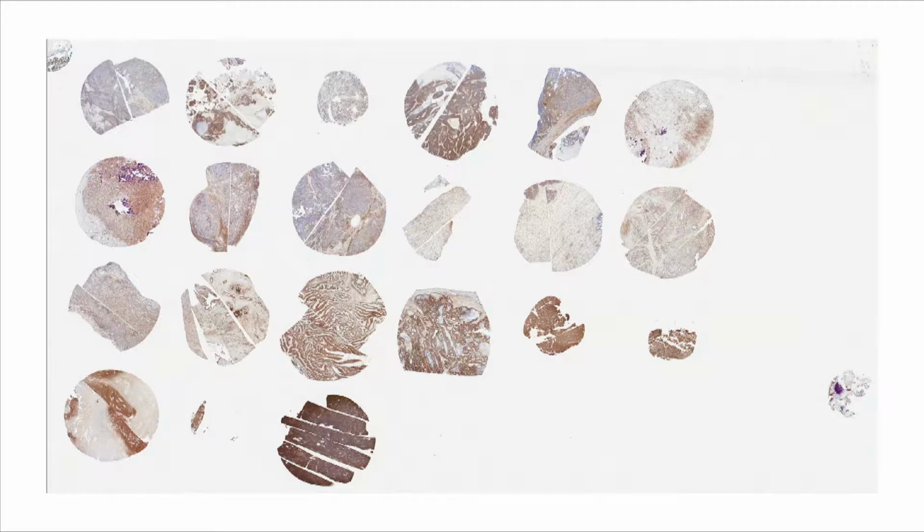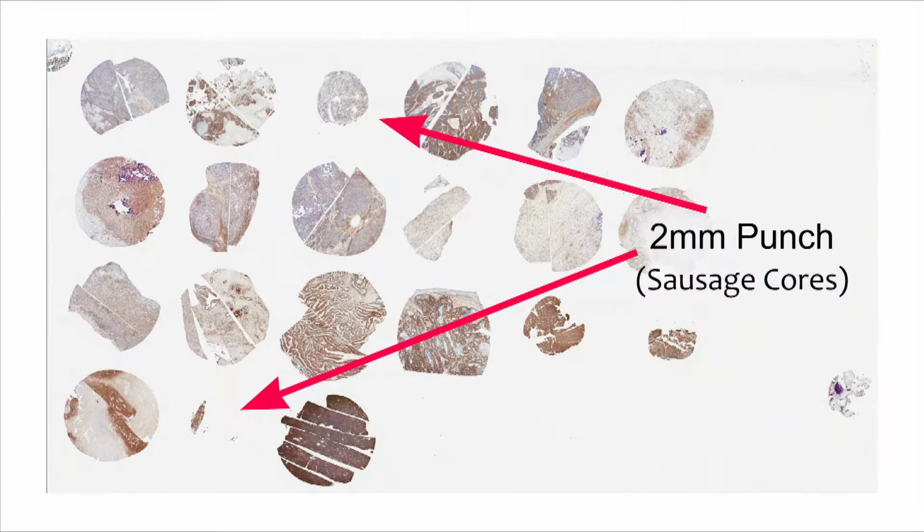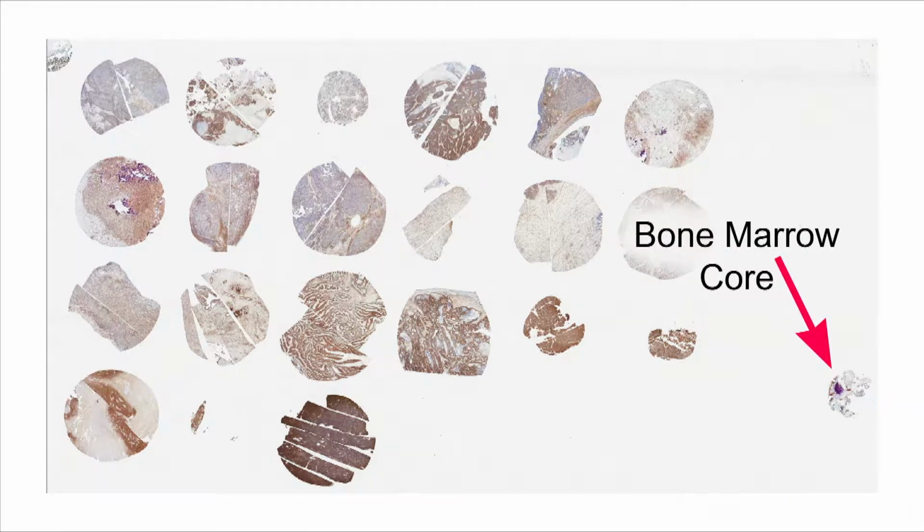There are several 2mm sausage cores in this TMA. We were limited on the amount of tissue we could use, so we had to use a smaller core size needle to make these tissues work. This is actually a 3.5mm tissue microarray.